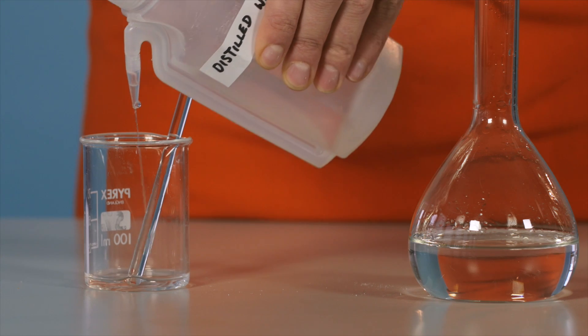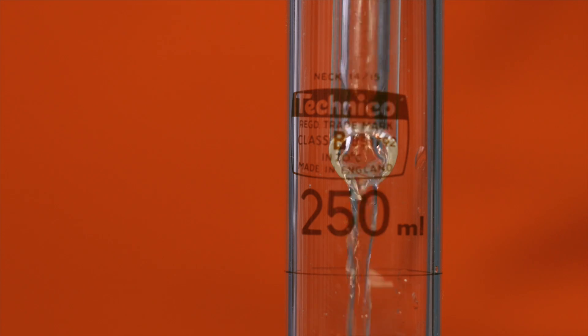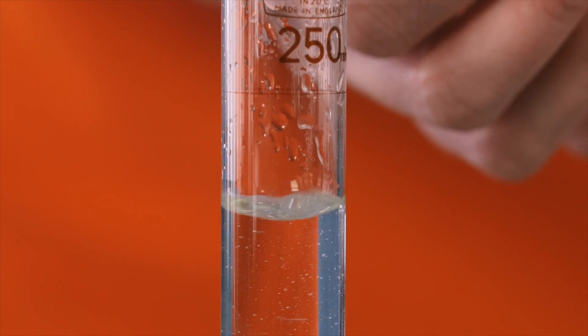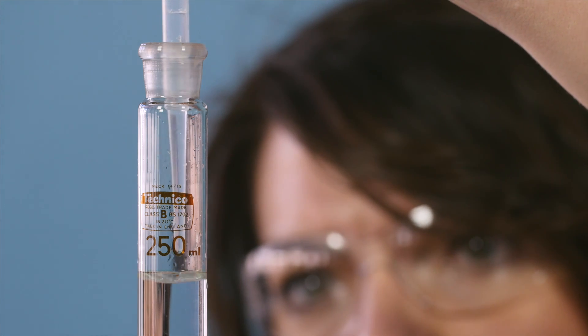Take care to only use a small amount of water so as to not go higher than the 250 centimetre cubed mark on the volumetric flask. The same should also be done with the funnel. Add distilled water to the 250 centimetre cubed mark. Take care to observe the meniscus at eye level rather than from above or below.